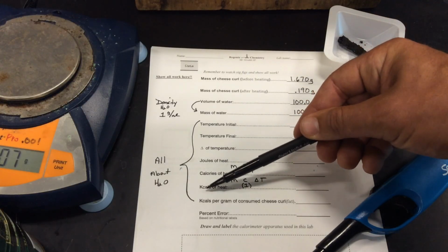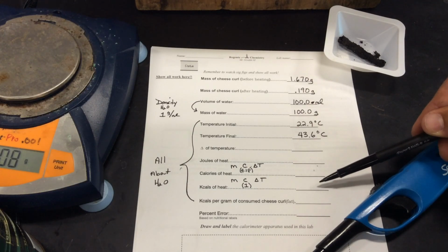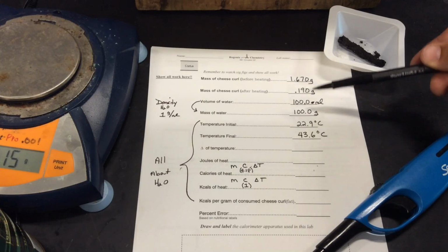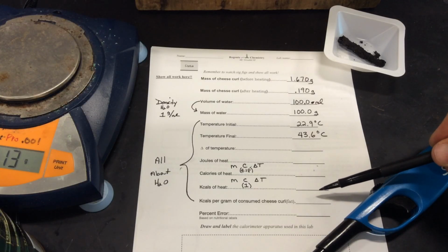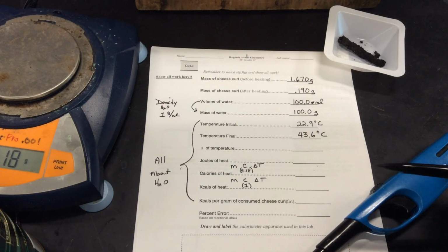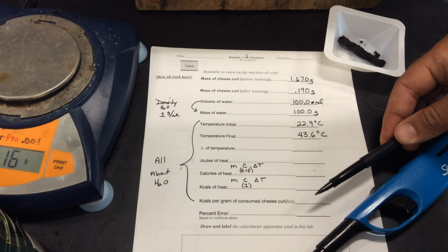There's a conversion. We've worked with that, right? You can see how this course is building on itself. So take this little c of calories, make it to kilocalories. Then from there, take your kcals, which is now the actual nutritional calorie, divide by the gram of what? Of Cheeto that actually burned. That's your fat. And that'll give you your calories per gram, and that's your experimental. Now to do the percent error, you're going to have to go to the nutritional label, which is on the other sheet, and calculate the kcals per gram of fat burn from the nutritional calorie and compare it. And that's what I'm asking you to do.